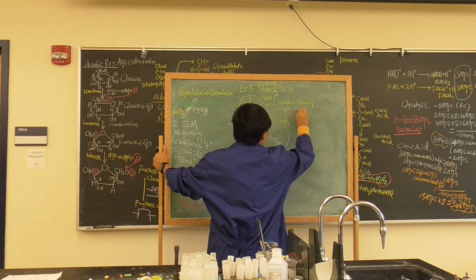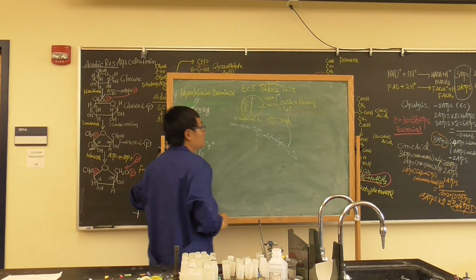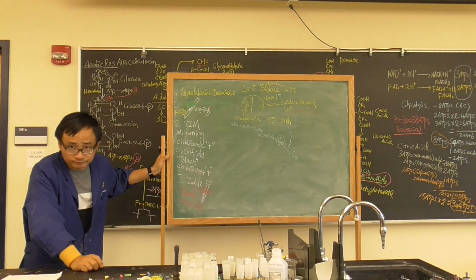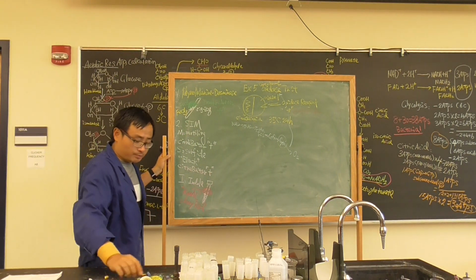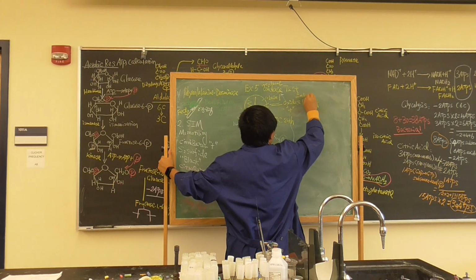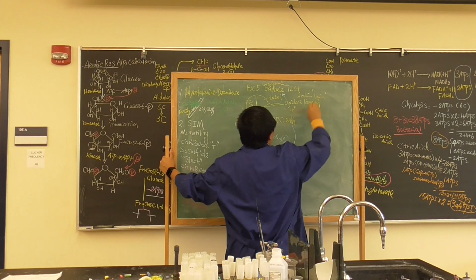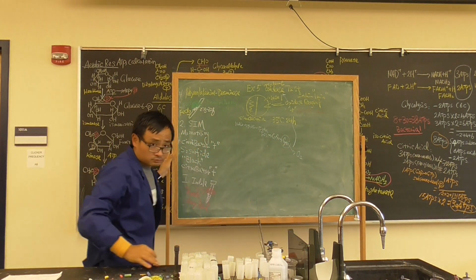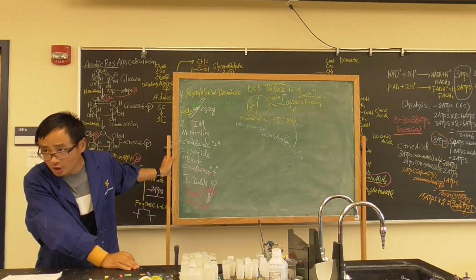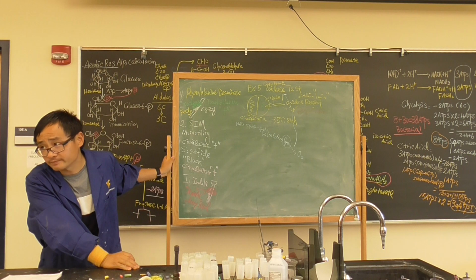If it's purple, it's positive. Otherwise, it's negative. But there is a very important thing you need to know. The oxidase test you have to read within 1 minute once you add the reagent. If you leave the plates open in the air for about 3 hours, everything is positive because there is oxygen in the air.